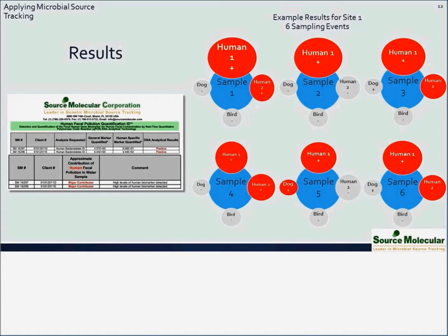The second element is, okay, it was present, what was not necessarily the relative contribution, but what was the magnitude of that source in my sample? Was there a high signal strength, a strong signal of human fecal indicators, or was there a low signal? And then on the right column, we set up an example set of results from, let's call it site 1, 6 sampling events.